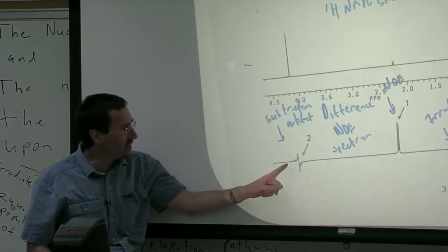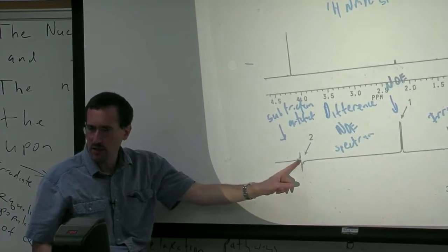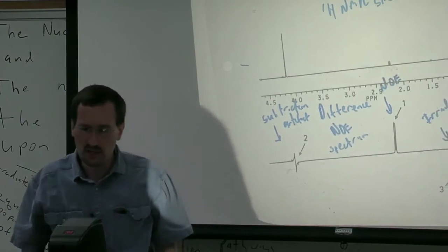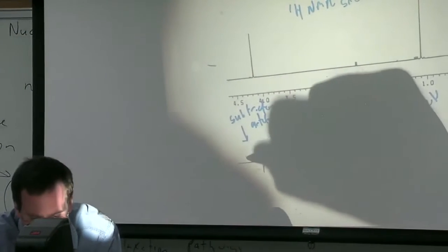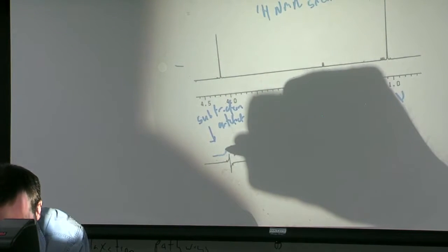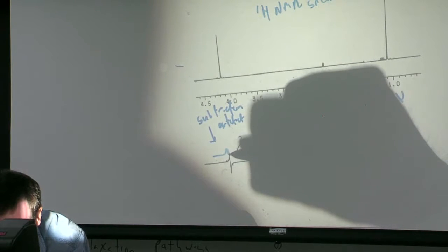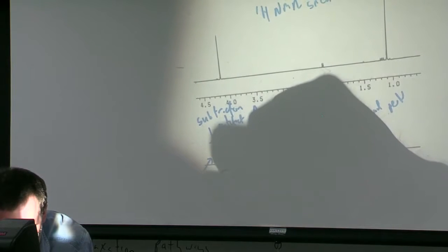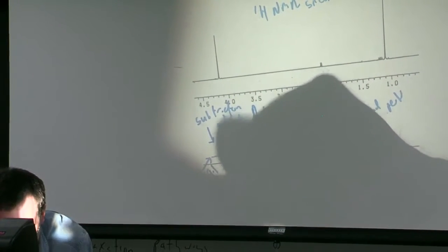If I were looking at this, I'd know just from recognition that there's no NOE, but another very good way, and something you really should do, is slap an integral on it. And if you slapped an integral on it, of course the integral would go up as area registered and then go back down, and you'd end up with no net rise, no net area.